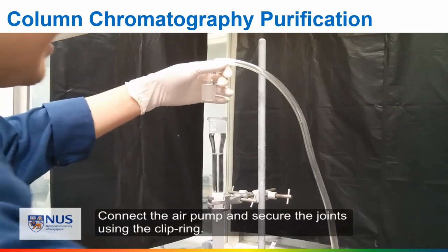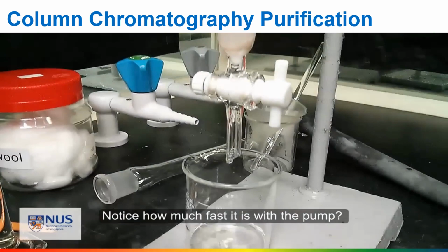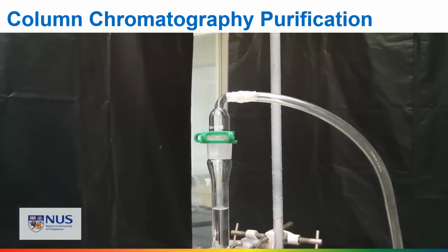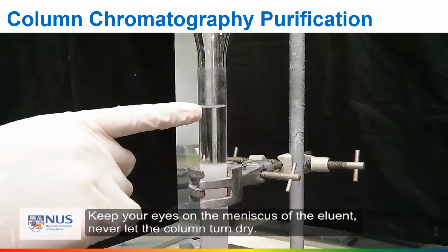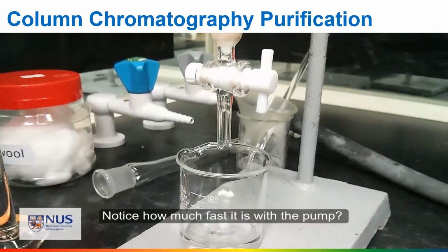Connect the air pump and secure the joints using the clip ring. Check out the flow rate. It's much faster. Keep your eyes on the meniscus of the eluent and never let the column turn dry. The solvent must always be above the silica gel. Notice how fast it is with the pump.